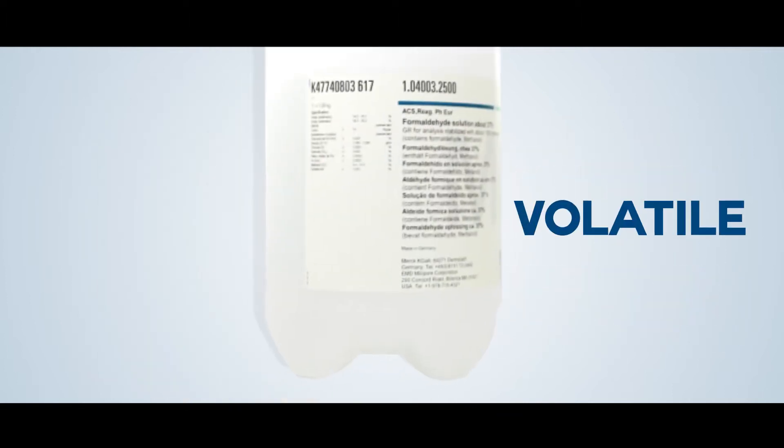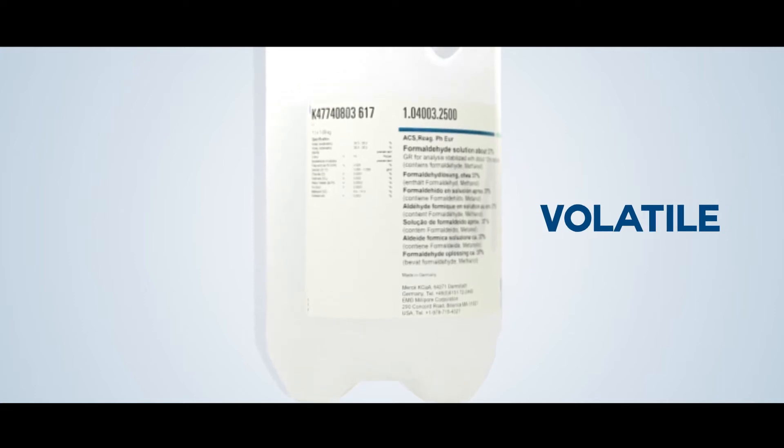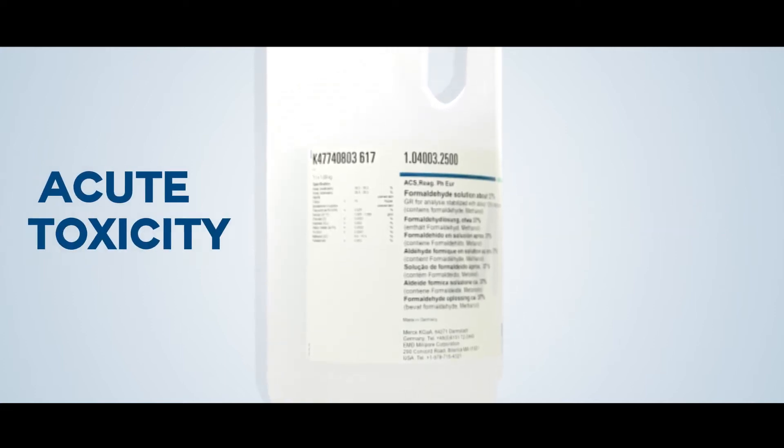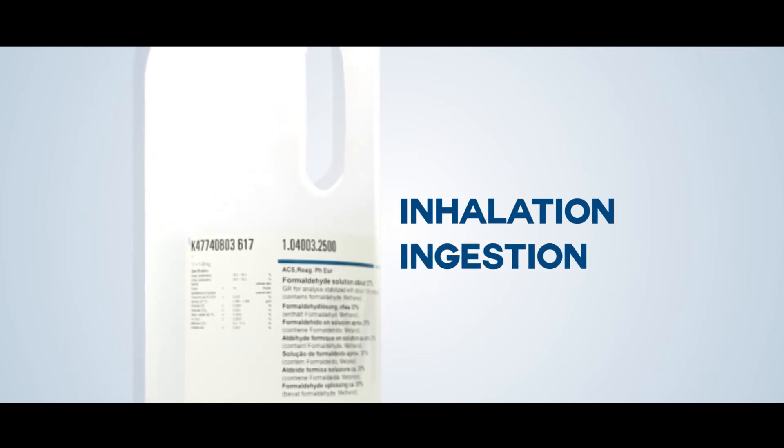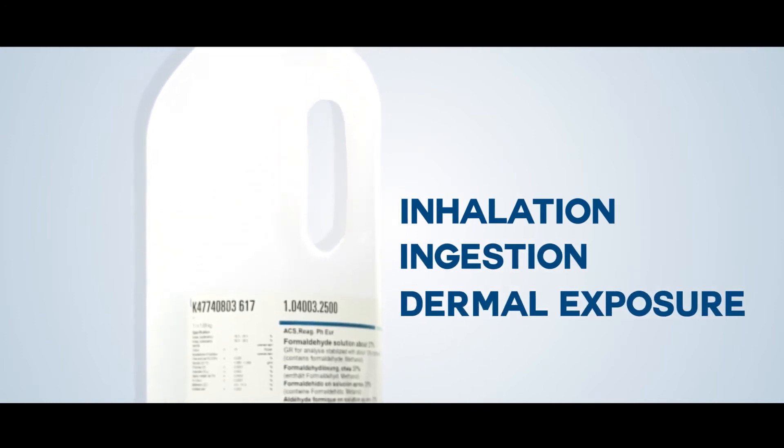Formalin is highly volatile and has a strong, irritating odor that causes acute toxicity to the user by inhalation, ingestion, and dermal exposure.